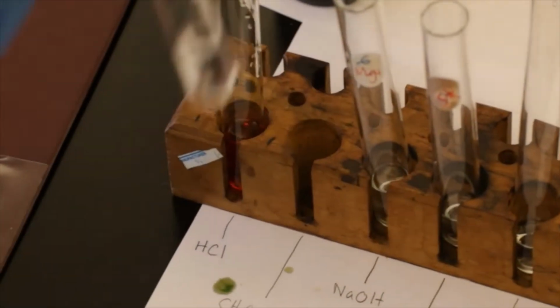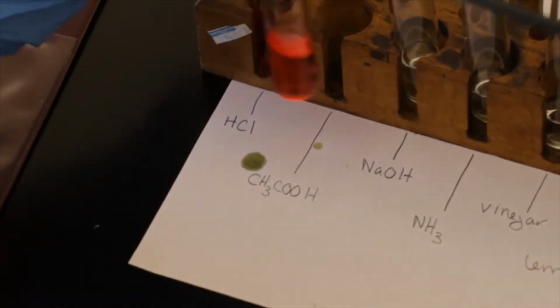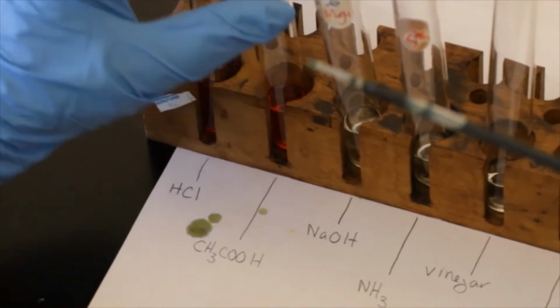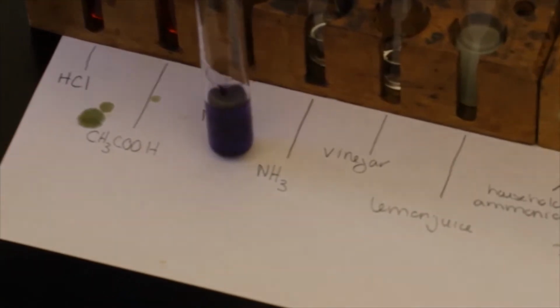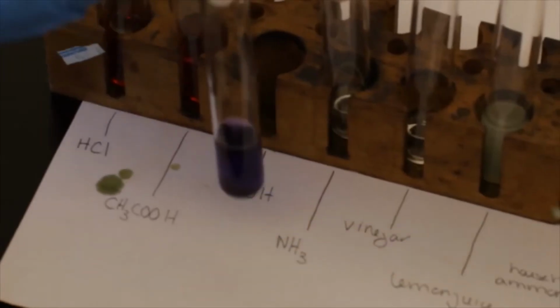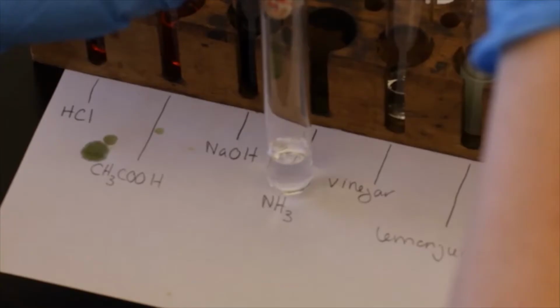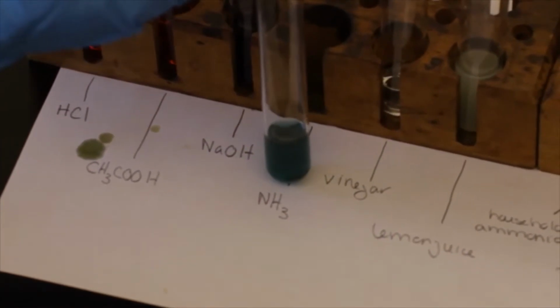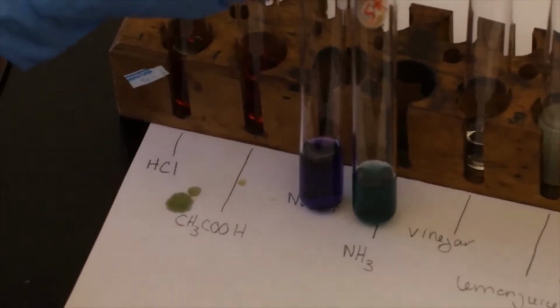Let's try the acetic acid. Here we are, a red too, but we're a little lighter. Now NaOH. 2 drops in. We are a nice, really dark purple color. So again, that's different, but NaOH makes sense, that's the base. Let's do some NH3. Add a couple drops in. And we are a green, almost like a tealish color. So not the purple, but a green.